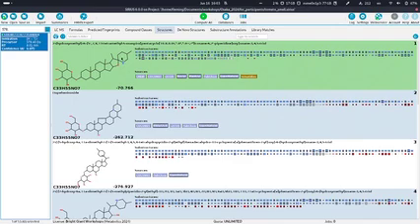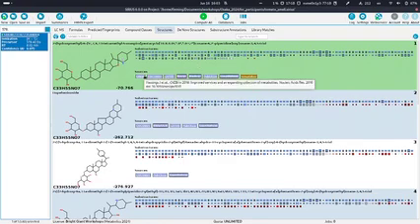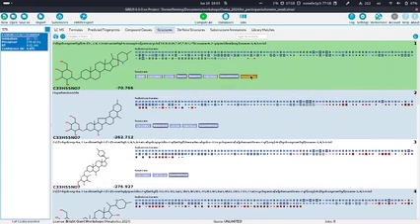And what is very new and what I want to show here is that we not only have sources here from the normal structure databases like PubChem, LOTUS, and so on, but we also have a hit in something else. And this is a custom database which we have created and which we have run again. So as I said already, you can search also in your own custom structure databases if you want.